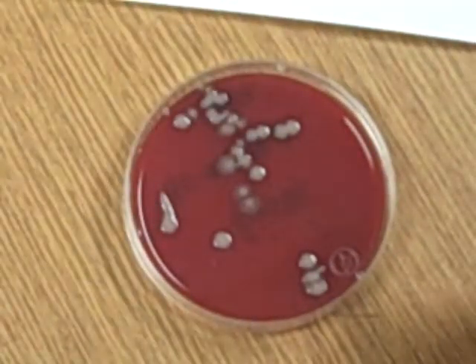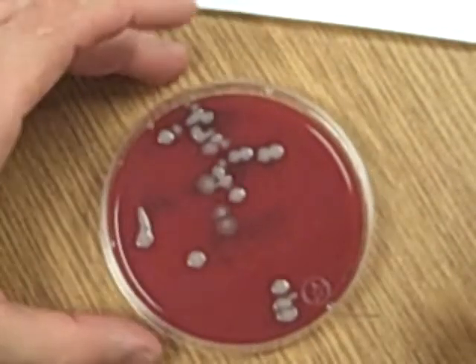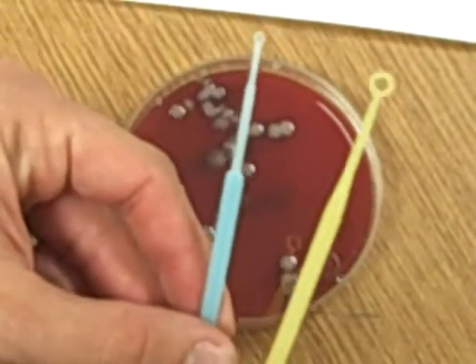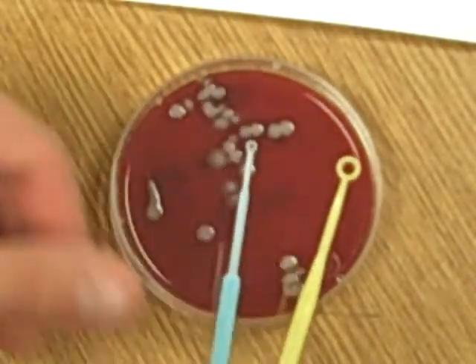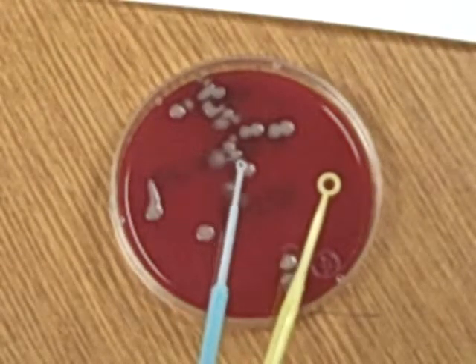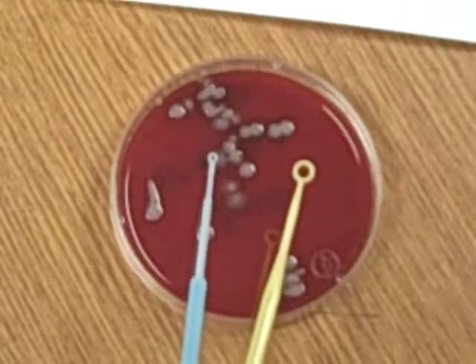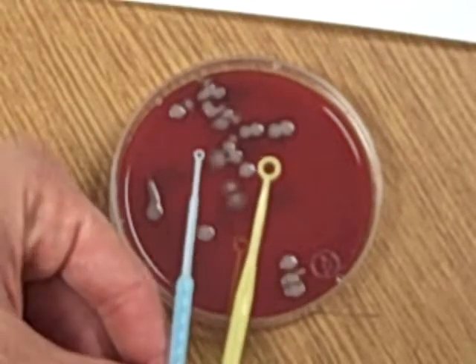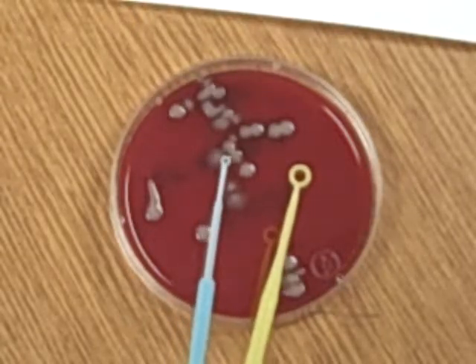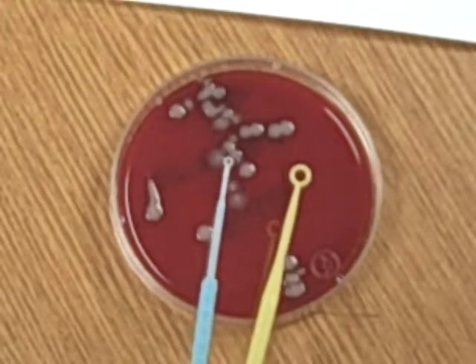Okay guys, so what I want to do here is try to explain this whole microliter loop number of colonies thing that I think has been somewhat confusing to people. So in the micro lab, we often use what we call calibrated loops in order to streak out our urine cultures. And what using these loops does is it gives us an idea or an estimate of the quantity of bacteria that come from every certain volume of urine that we use.